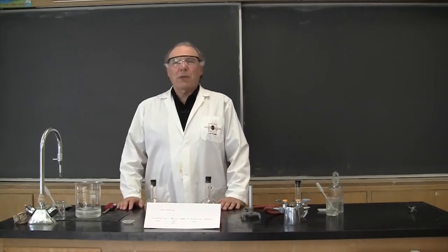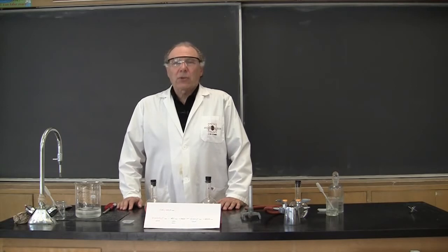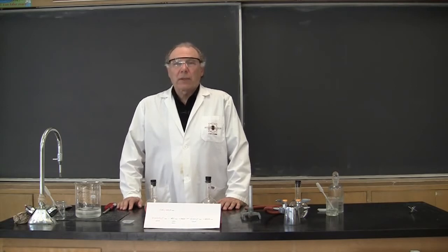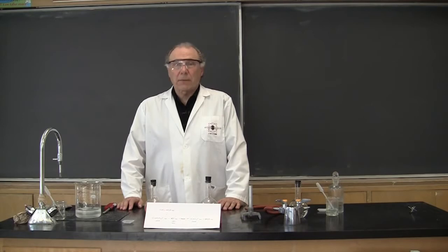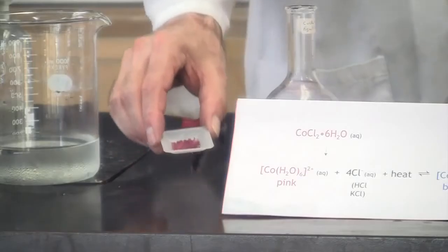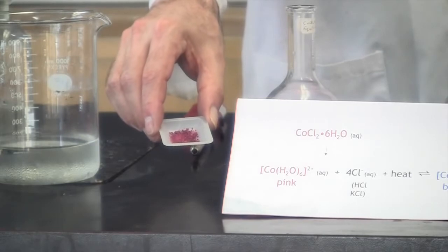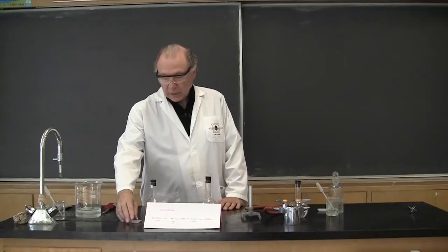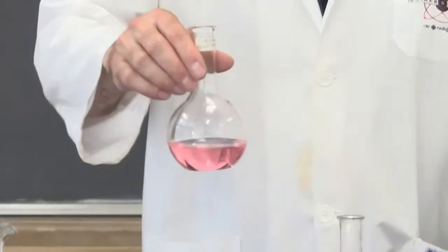Hello, my name is Peter Bloch and I'm a teacher from Northern Secondary School. I'd like to show you a demonstration for equilibrium involving the cobalt chloride system. As you know, cobalt chloride is a pink solid and when dissolved in water it gives us this nice pink color.